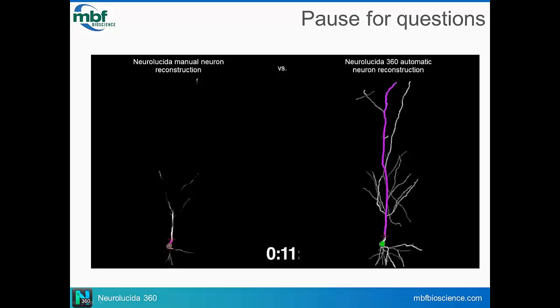Another question that has come in is whether or not we can do Sholl analysis, and the answer is yes. Neurolucida has done Sholl analysis for 25 years, and so it is a simple analysis request in Neurolucida Explorer, which I'm going to talk about yet.